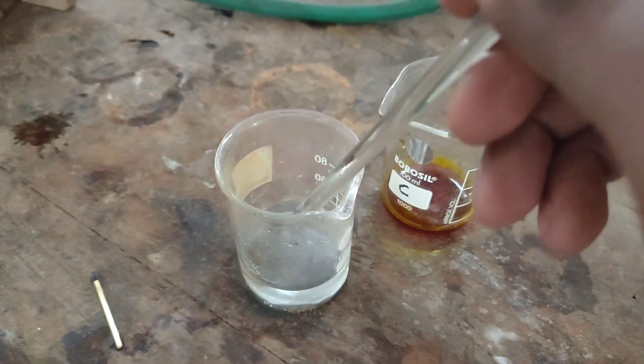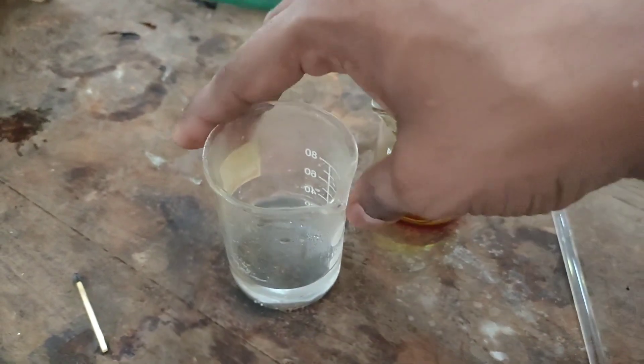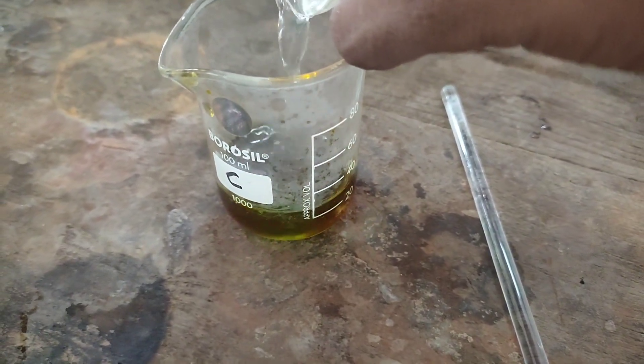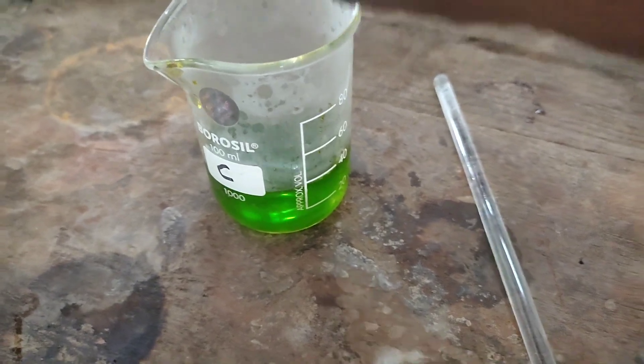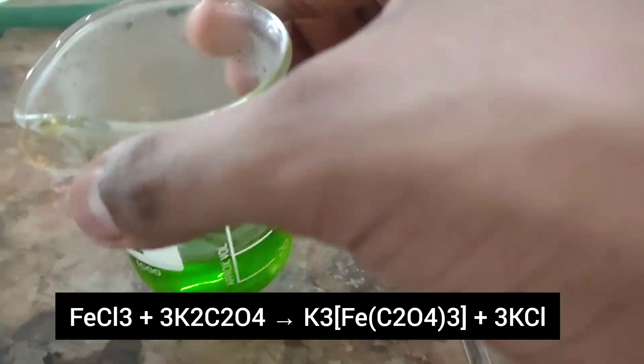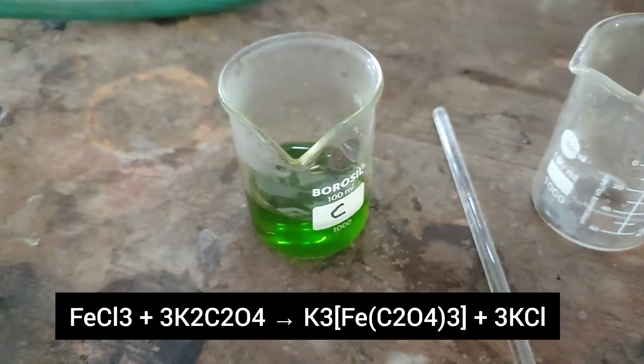When all the solid dissolved, I took the potassium oxalate solution and poured it into the ferric chloride solution. You can see that the color of the solution turned from reddish brown to green. This is due to the formation of the potassium trioxalato ferrite complex.